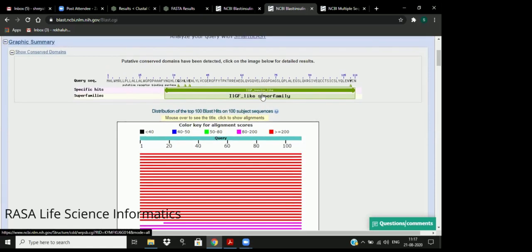You can study these two families in the conserved domain database to understand what kind of characteristics your protein may have. I am considering that I do not know anything about insulin, that insulin is a new subject for me, forgetting that most of the data is available.